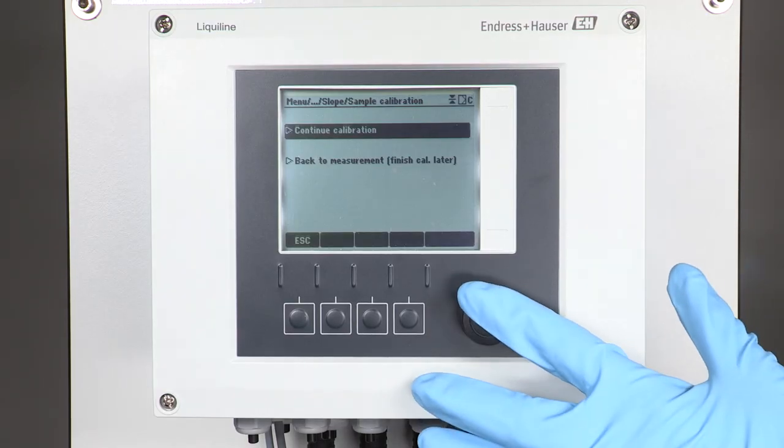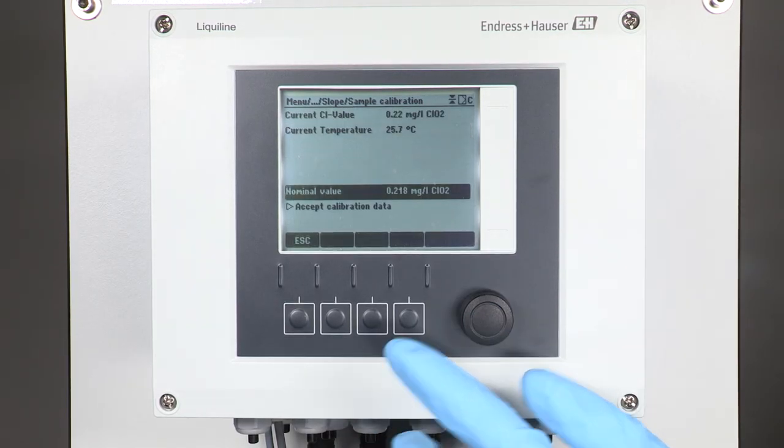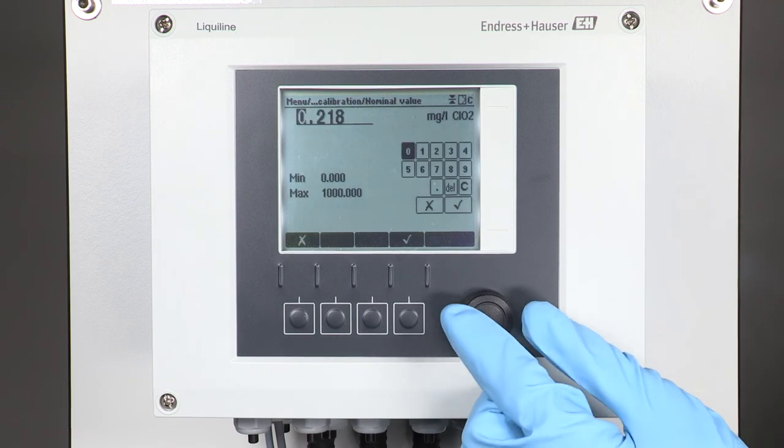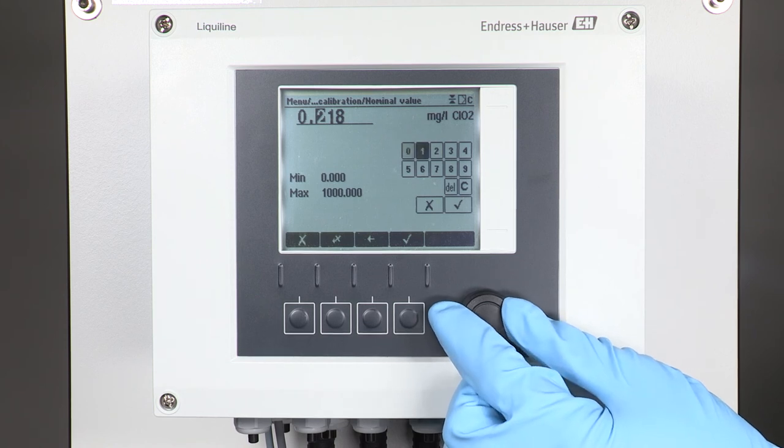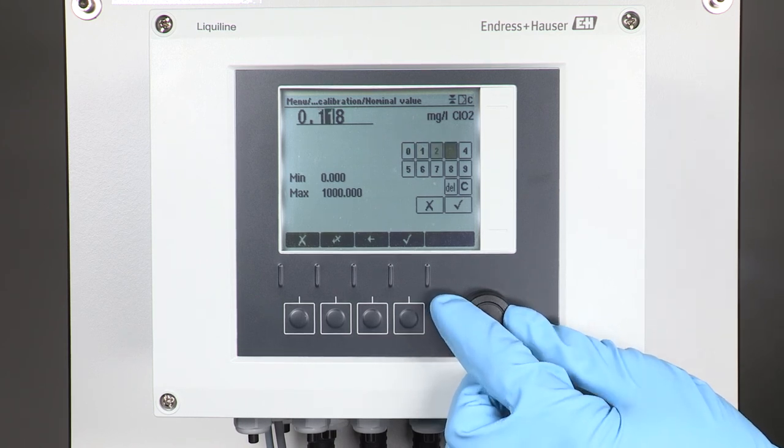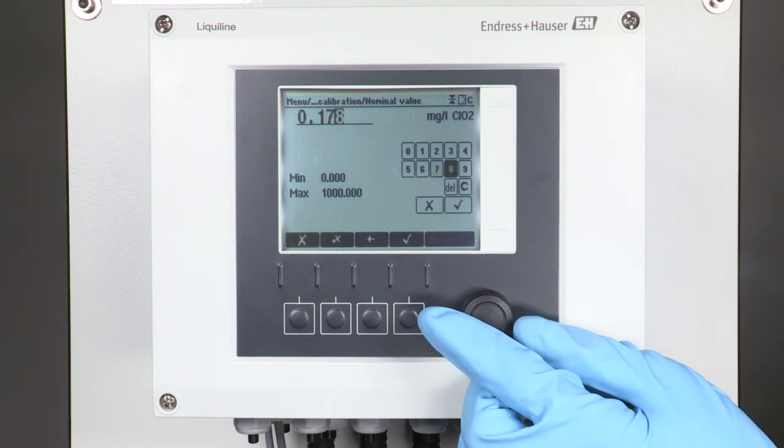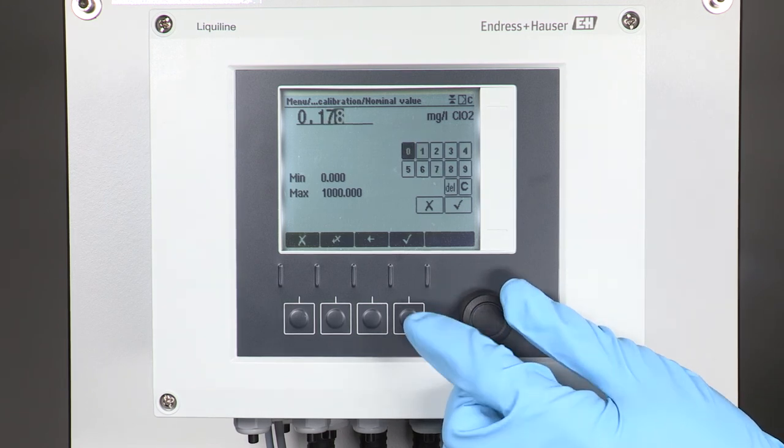We continue with the liquid line by entering the Chlorine Dioxide value which was shown on the photometer. Once the new slope was found to be within the allowed range, the transmitter allows you to store it in the CCS50D sensor head for adjustment.